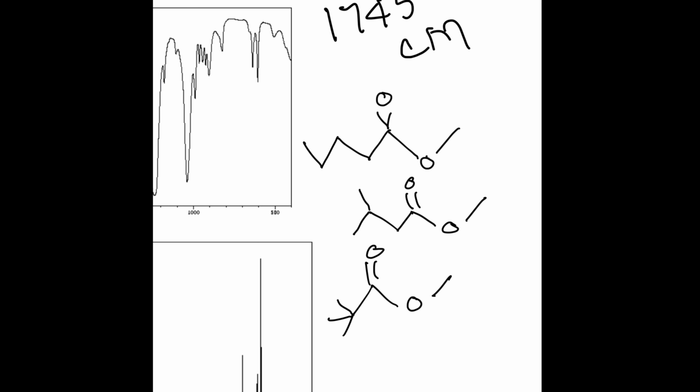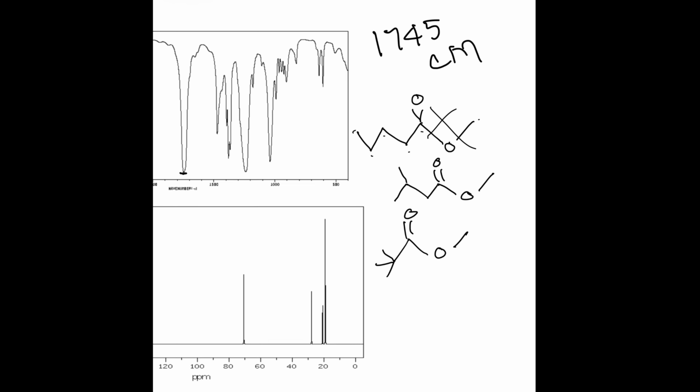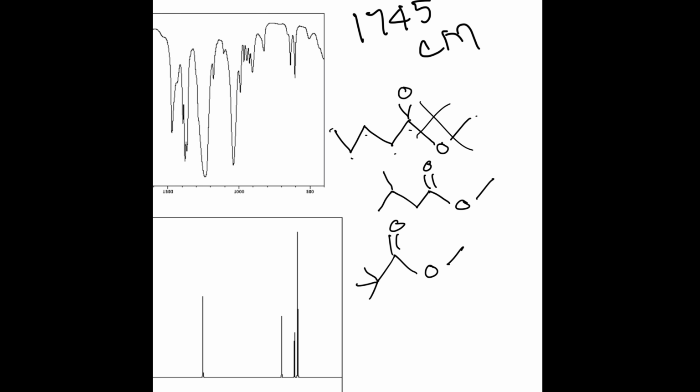So in this first structure here, we have 1, 2, 3, 4, 5, 6 carbons, which would make this structure not the real structure because we are only looking for 5 unique carbons. So yeah, the premise is 5 unique carbons. That's what we're looking for. The structure has 6, therefore it cannot work.